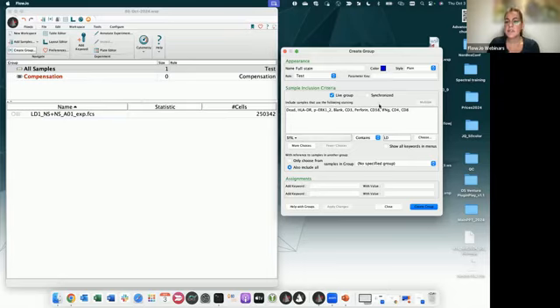Okay, so in case you want to create a template, please have the live option on. The synchronized option is slightly different. It's related to the gates that you perform. Whenever you have a group, you can create a group-owned gating strategy, and the synchronized group will allow each gate to be automatically adjusted on each sample. I'm going to show it in a second.